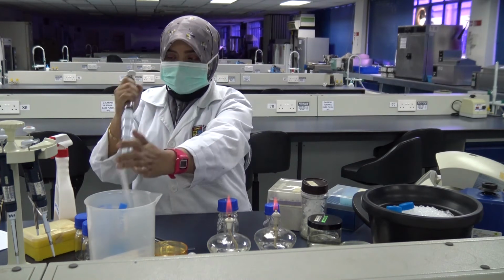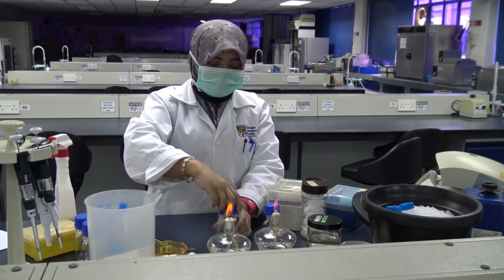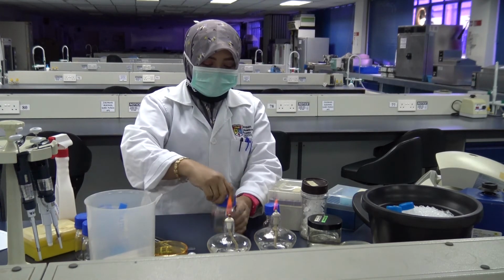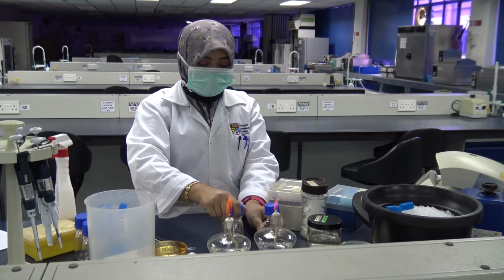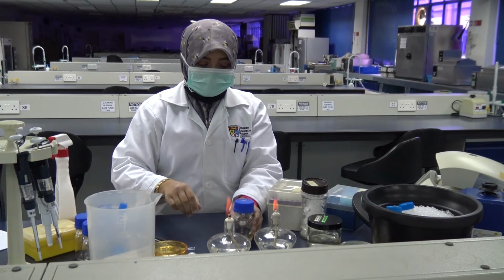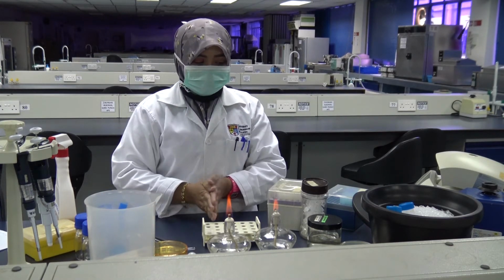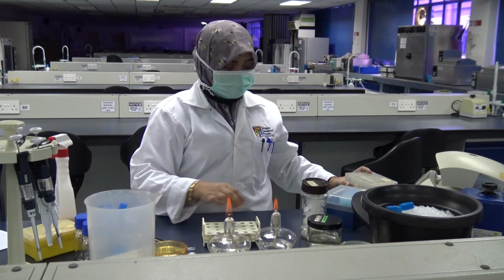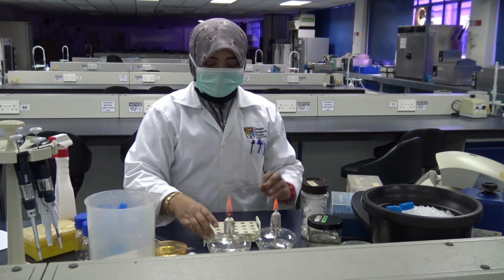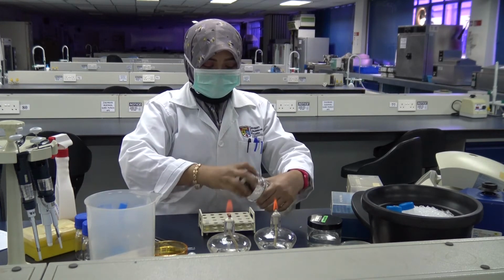Once that's done, mix this mixture of Pseudomonas aeruginosa and the nutrient broth. Now you have 20 ml of this suspension in that bottle, and leave that for 30 minutes at room temperature. While it is incubating, prepare your tubes for dilution.